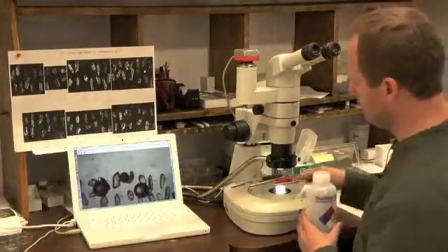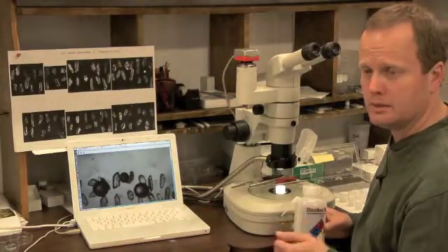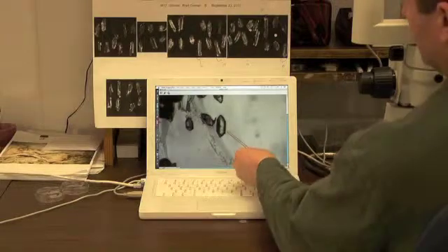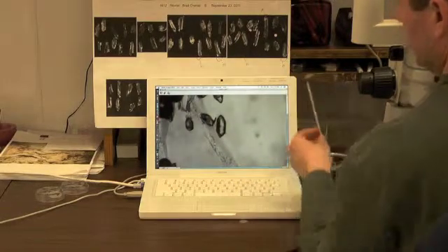To begin, I'm going to put a small amount of water on the surface of the mount. That helps to keep the zircons in place as we lever them out of the epoxy. I'm now going to extract this zircon crystal, which has a very simple cathodoluminescence pattern.